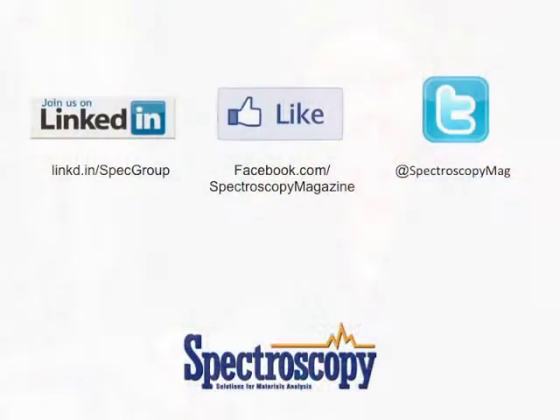What are the main challenges in performing this type of microscopy? The technique referred to as STED, or stimulated emission depletion imaging, was first pioneered by Stefan Hell many years ago. There are challenges to doing STED imaging, and then I'll address the challenges to doing STED lifetime imaging. In STED imaging, the shape of your two pulses, the one that turns the fluorophores on and the one that turns the fluorophores off, is very critical.